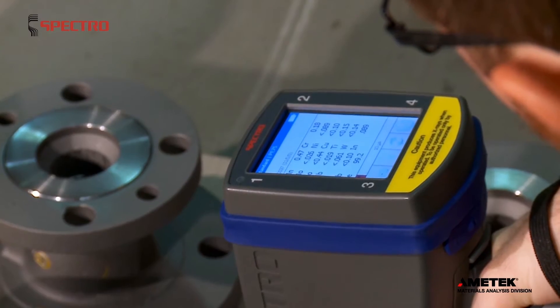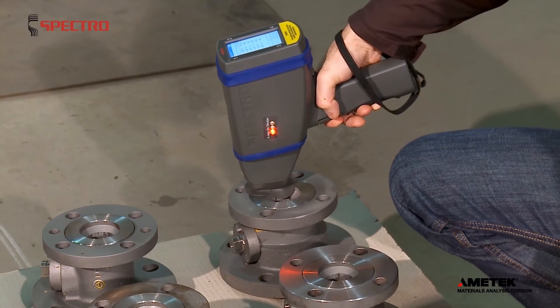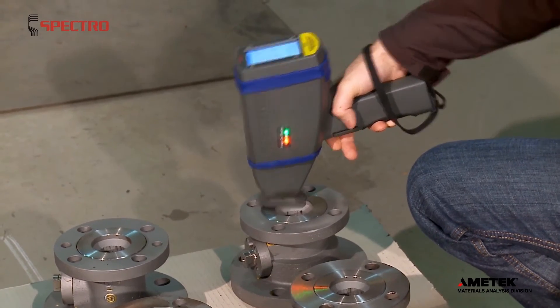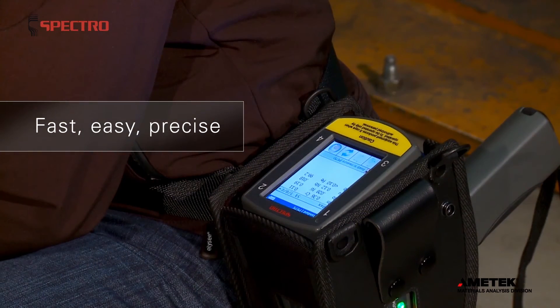Exsort testing is non-destructive. That's critical for applications such as finished parts, like polished sealing surfaces. Unlike ArcSpark instruments, Exsort leaves no burn marks. It's the fast, easy, accurate analysis you want everywhere on the job.